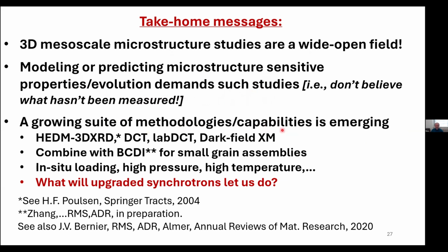And there's a growing suite of methodologies and capabilities. There are the techniques that I showed you. There's diffraction contrast tomography. There's even a laboratory-based version. And then dark field microscopy is something that's being developed by Henning Poulsen and company at the ESRF. We've worked on combining the HEDM measurements with Bragg coherent diffractive imaging, which I haven't said anything about, but we have a paper in preparation and a prior paper already published. This is restricted to nanograins at this point.